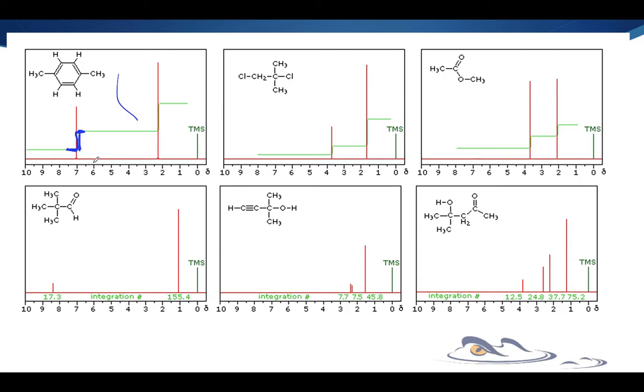And again, either you take a ruler and physically measure it, or they would put some number alongside of this to let you know. And notice how this one is taller in height than that one is. And so you can measure those 2 and come up with a ratio of them. So it's just another way that this could be integrated.